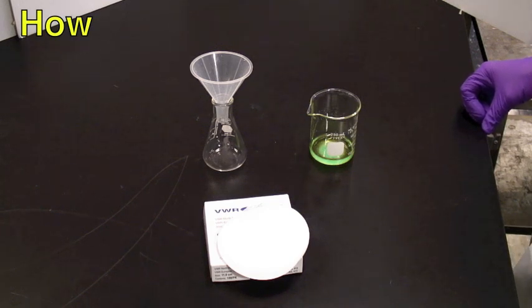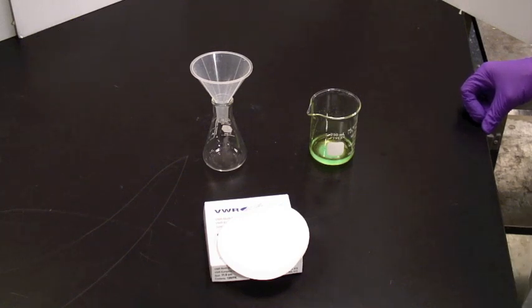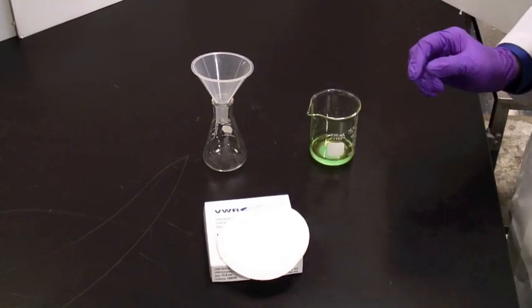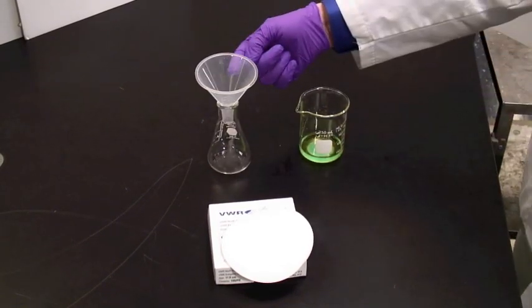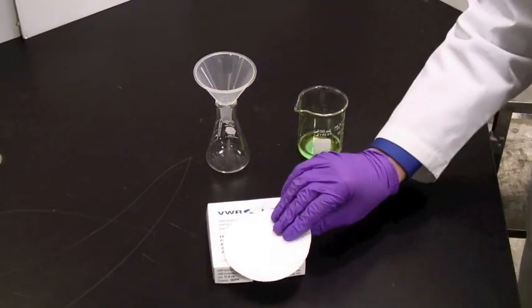There are several methods of filtering. Gravity filtration, which we're talking about today, allows separation with only gravity pushing the liquid through the filter paper. The paper is put into a funnel to support it, the slurry poured into the funnel, and the separation takes place as the liquid passes through the paper itself.